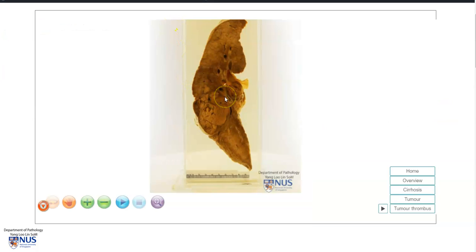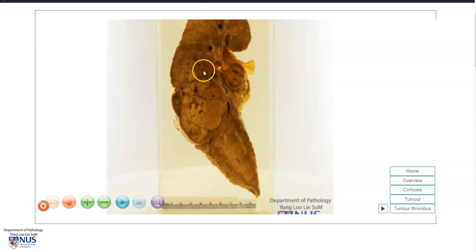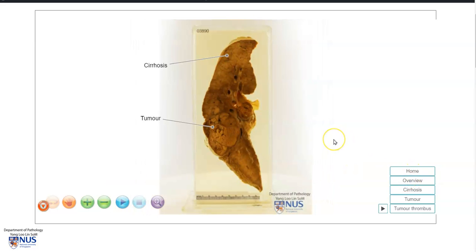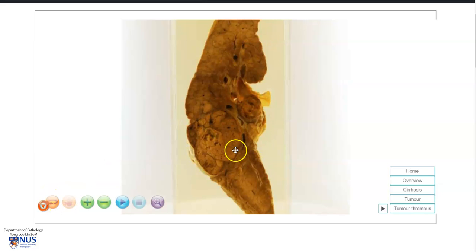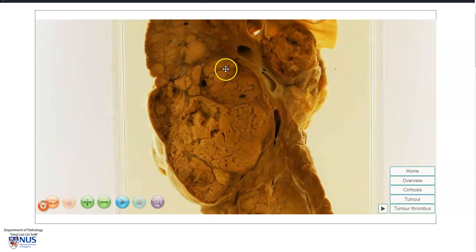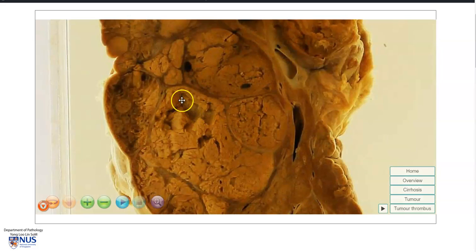This is another example of hepatocellular carcinoma, or HCC, this time occurring on a background of cirrhosis. Looking at the label, we can see this is the cirrhotic liver parenchyma and this region is the tumor. The tumor appears to be relatively well circumscribed, fleshy, and tan, and there are some areas of necrosis and cystic degeneration.